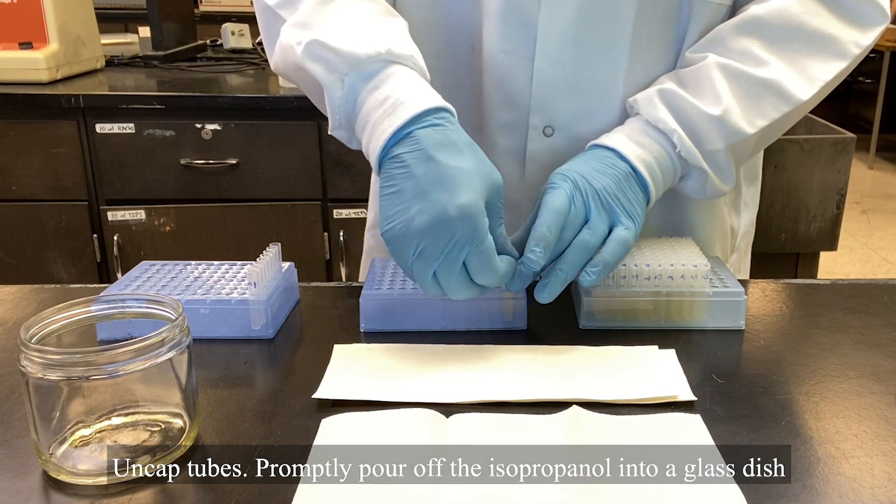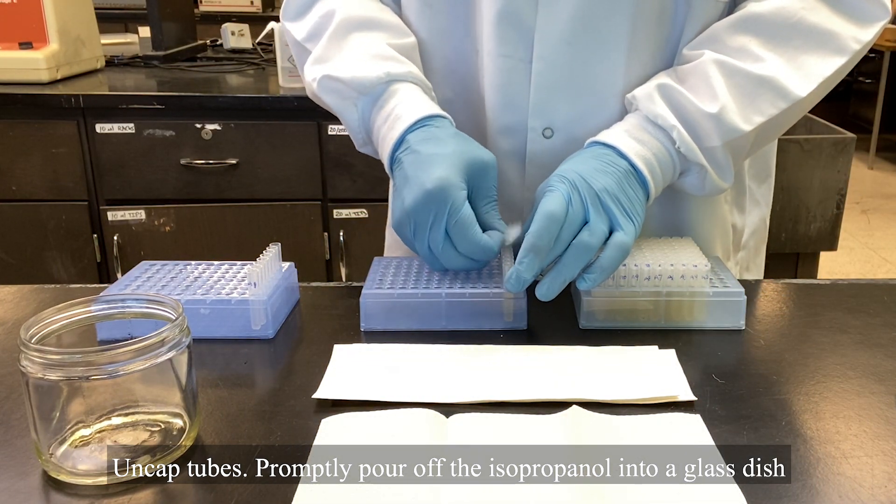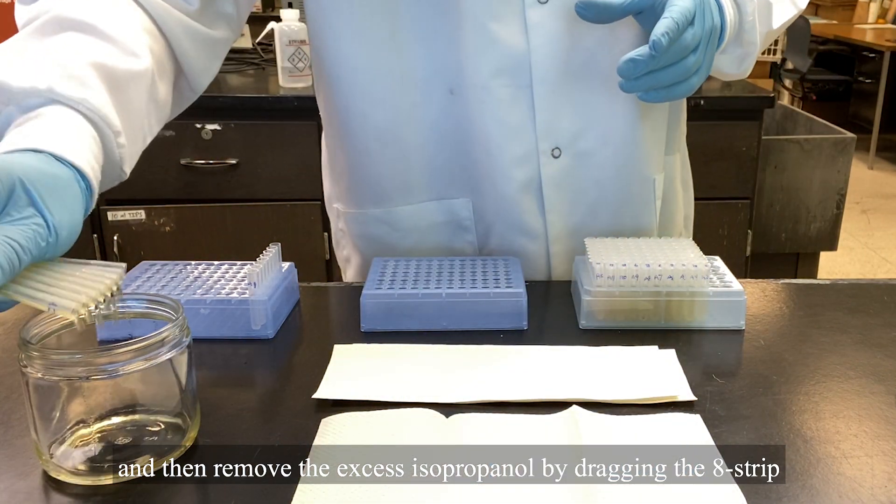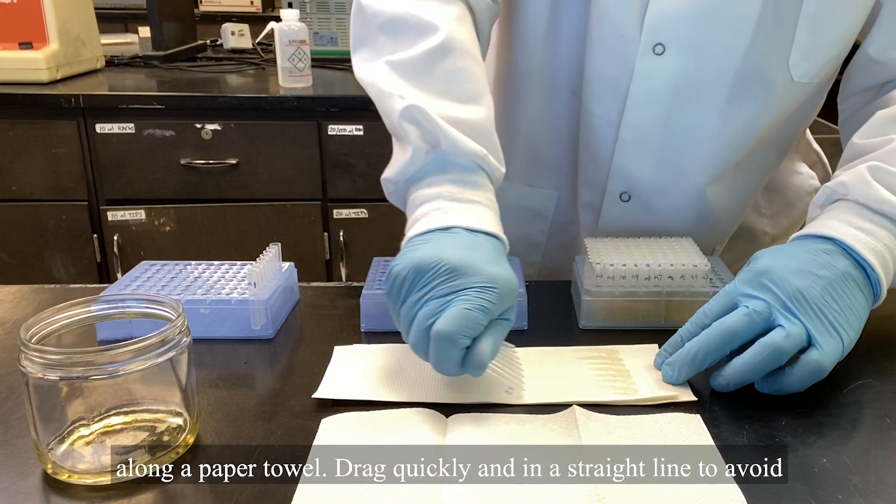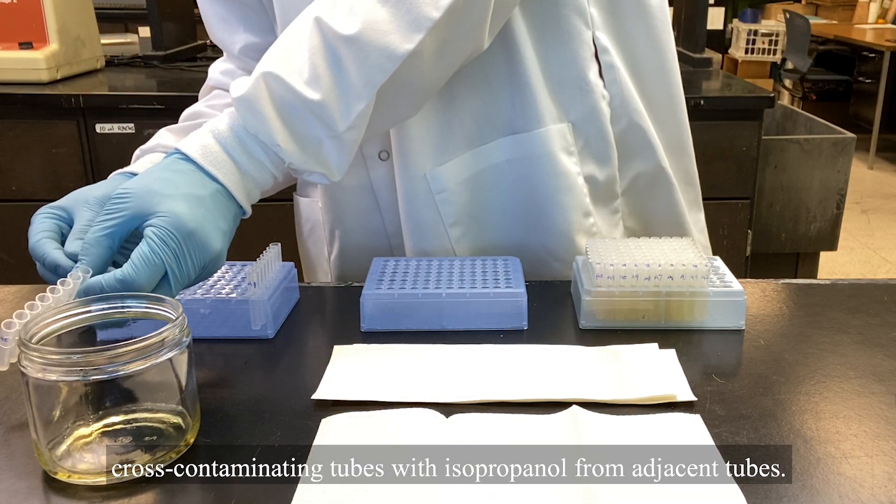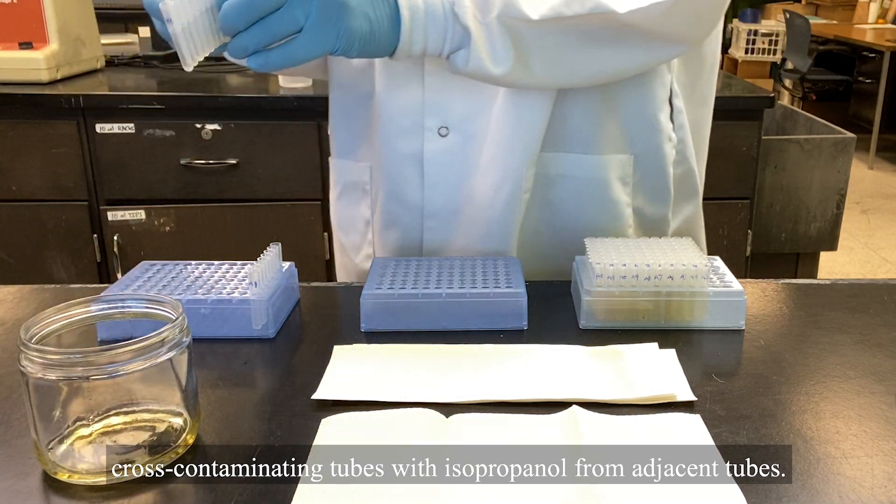Uncap tubes. Promptly pour off the isopropanol into a glass dish and then remove the excess isopropanol by dragging the H strip along a paper towel. Drag quickly and in a straight line to avoid cross-contaminating tubes with isopropanol from adjacent tubes.